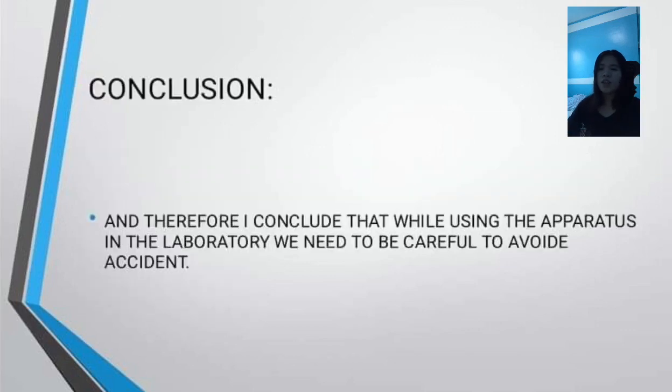So that's all for my conclusion, and therefore I conclude that while using the apparatus in the laboratory, we need to be careful to avoid accidents. Before using the apparatus, we need to study first how to use it to avoid accidents in the future.